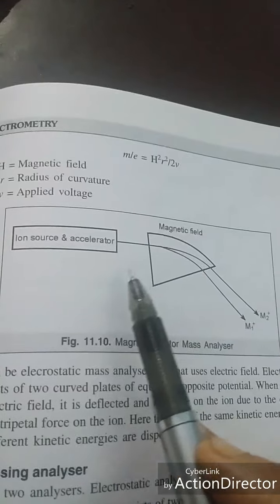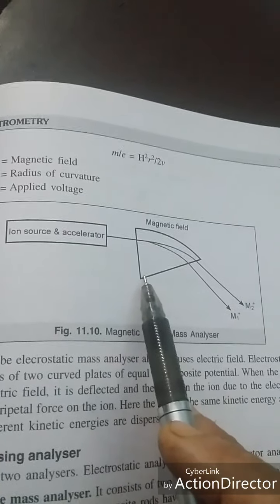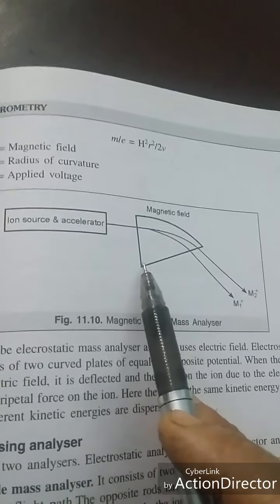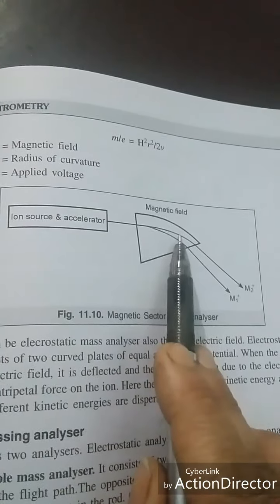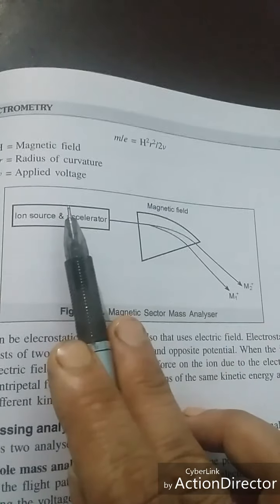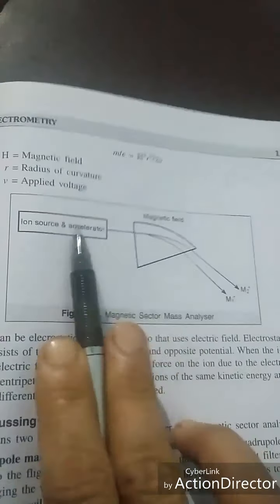This is how the mass analyzer works. Different types of mass analyzers are in use, and they analyze according to mass-to-charge ratio. This is the magnetic sector mass analyzer. It is based on the principle that charged particles are deflected by a magnetic field, and when moving charges enter the magnetic field, they are deflected in a circular motion.